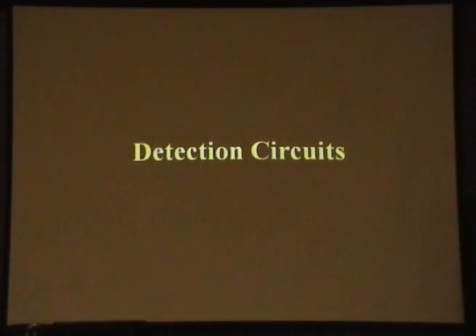Any questions on the first part of Carlos's talk? One quick one. You mentioned that one can measure temperature locally in a sample. What kind of spatial resolution could you have for temperature measurement? If you, for example, use confocal Raman, you can have the same spatial resolution as confocal Raman, which would be something like 400 nanometers in the transverse direction, or 600 nanometers in the axial direction. The question is, what temperature sensitivity can we measure? If you can only measure with a sensitivity of 10 degrees or more, it does not matter for biology. For biology, we need something that can measure temperatures of the order of 2 degrees.